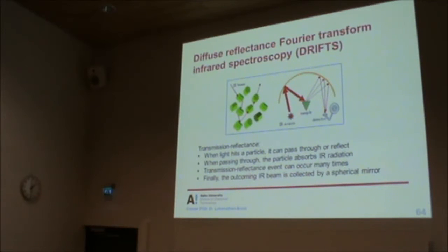Okay, so now you have an infrared source, it's reflected, and no matter which direction the light is dispersed, there will be a spread of radiation in all sorts of directions. And this hemispherical focusing surface will focus all the reflected radiation, no matter which direction it comes from, onto this detector.